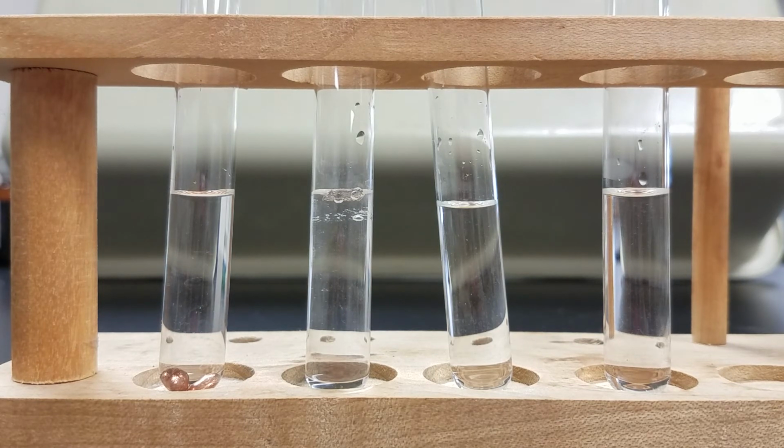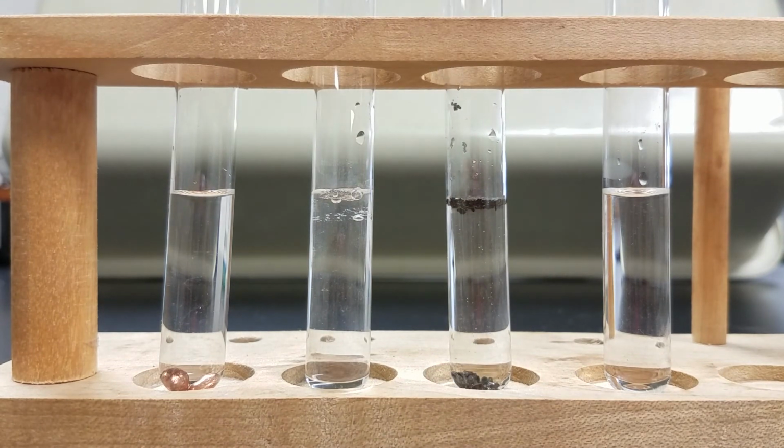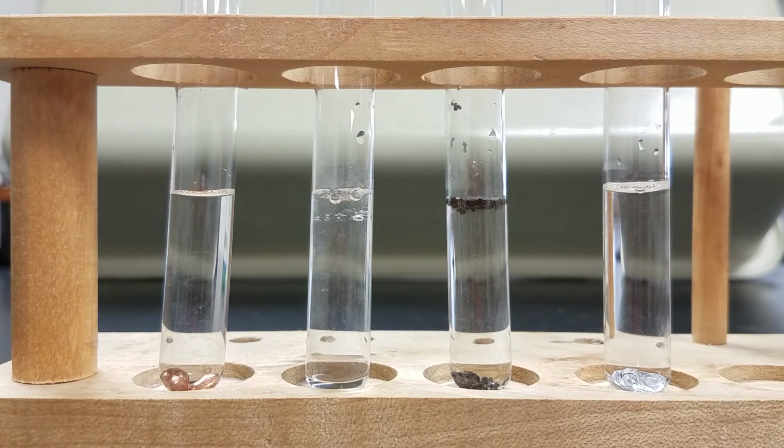So next I'm going to add a little scoop of iron to the zinc sulfate, and it kind of floats on the top, a little bit settles to the bottom. Nothing happening with the iron at all. And now the last one, I'm going to add a piece of zinc into the zinc sulfate, and it sinks.